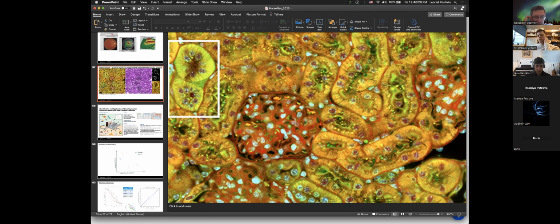Right. But segmentation is useful, but not the most interesting, I would say. Maybe Will disagrees. We would like not to just segment, because segmentation is flat annotation. So what does segmentation allow us to do? It maps this image into a set of values per tubule. We would integrate protein signal within this object, and within this object. Protein and lipid within an object like that. So we would map the whole image into a set of total lipid and total protein per tubule. Does that make sense?